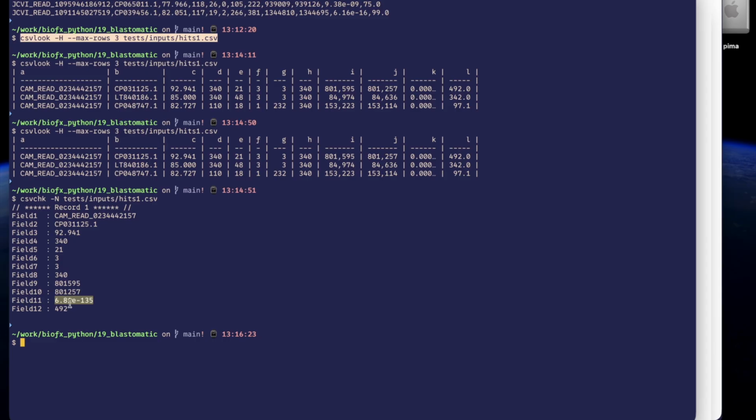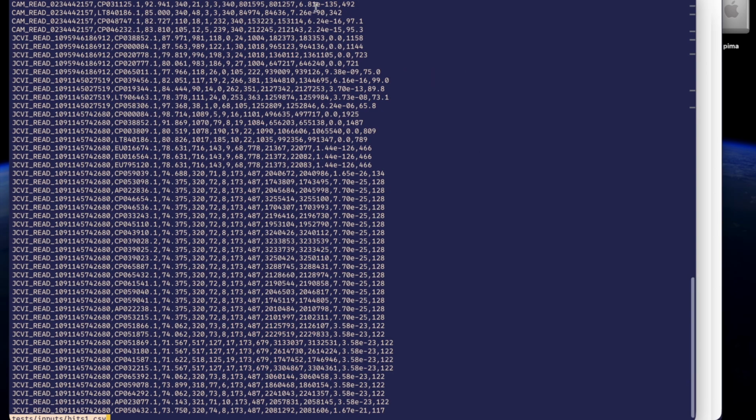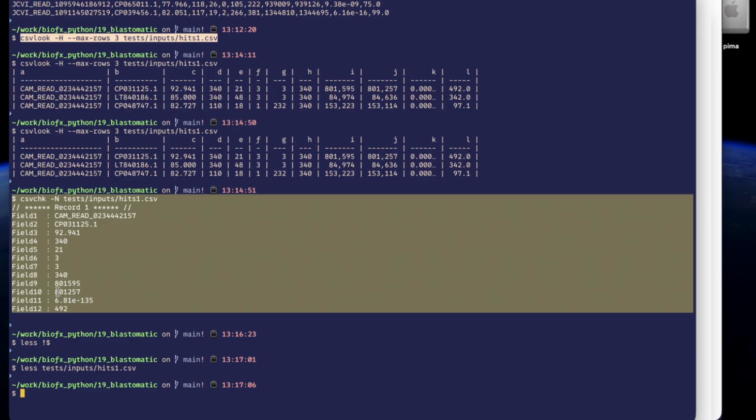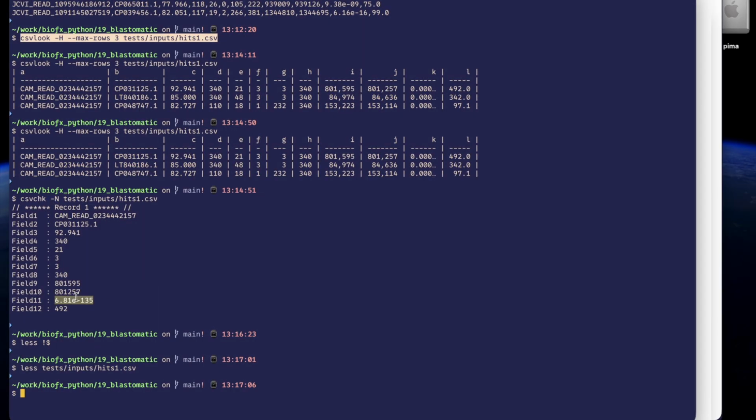So this is probably what's raw. Let's just look at that, and we see here, yes, indeed, it's just scientific notation. And CSV Kit was doing something clever, which is turning that into an actual floating point number, but then it's such a ridiculously long number that it can't show it, so it has these ellipses. In this case it's not doing anything fancy, it's just showing us the text, but we're actually able to see what the value is.